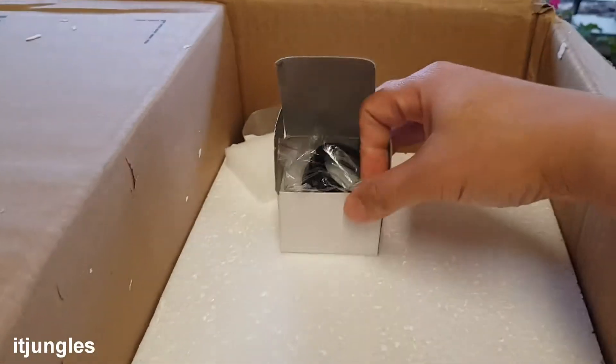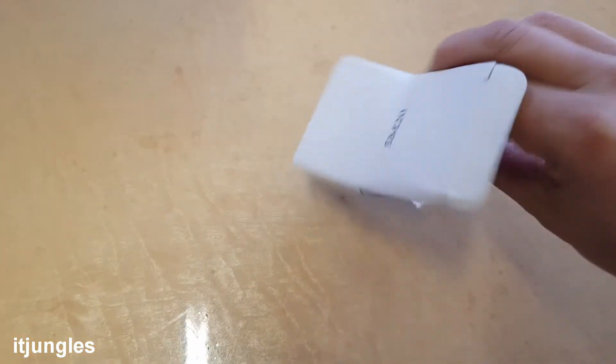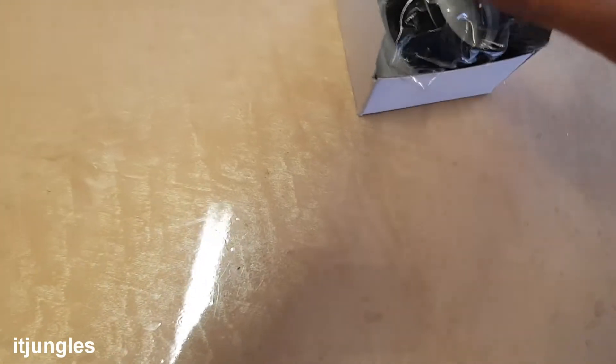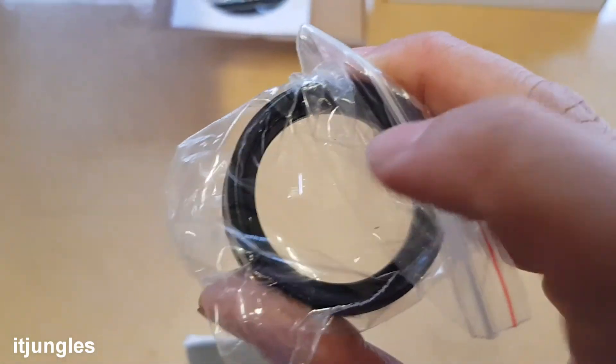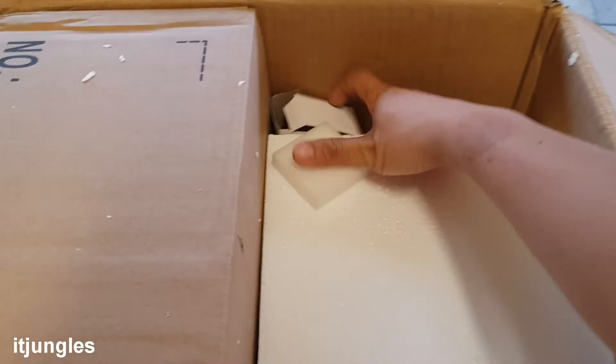There's another part here — it's going to fall out of the box already. Up here it says SM20 on the box. It's quite heavy, and this is glass right there, so I'll put that to the side with that box.